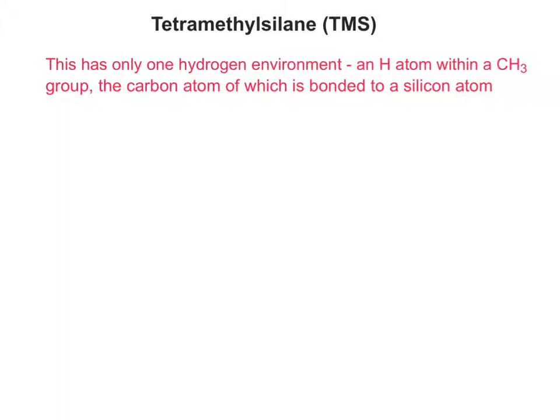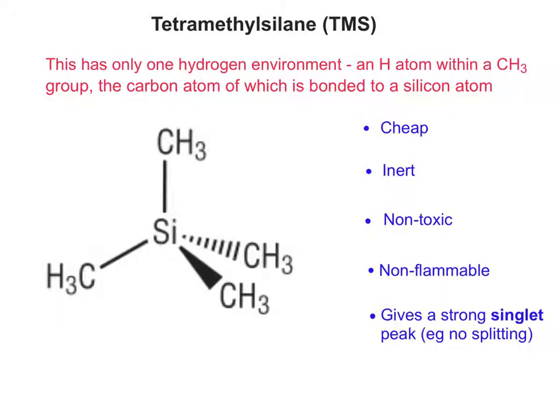So I mentioned tetramethylsilane, or TMS, in passing a couple of minutes ago. This is used as a standard against which all of the environments in your sample can be compared by the spectrometer. So there's a number of advantages to this particular compound. Most of them are to do with its practicality and its health and safety aspects. But it also gives a strong singlet, so no splitting of the peak. So that's what we're going to talk about next.